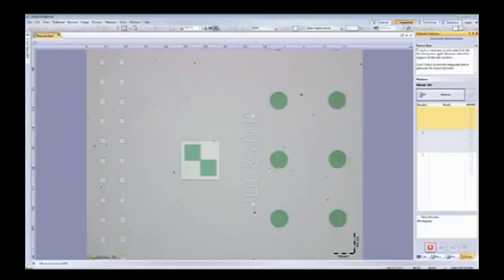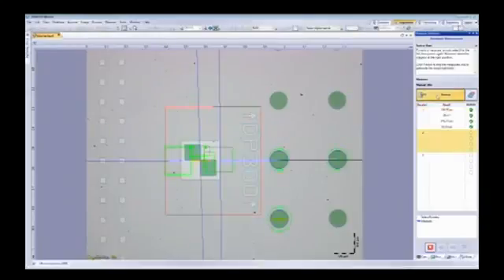It's going to measure some circle distances and stuff, and that's all done by a button click. It's going to automatically define the pattern, mark the scanners for us, mark the line edges. It's going to give us a width measurement, our angle measurement, our distance between the circles here and the diameter of the other circle down here.